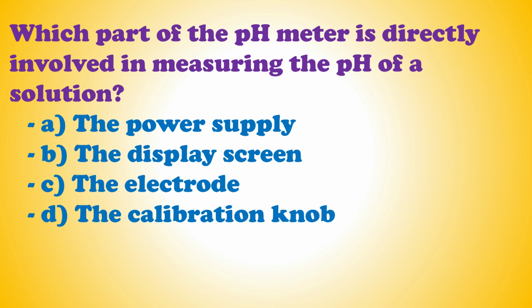The next quiz is this one. Which part of the pH meter is directly involved in measuring the pH of a solution? The power supply, or the display screen, or the electrode, or the calibration knob? Give your answer now.